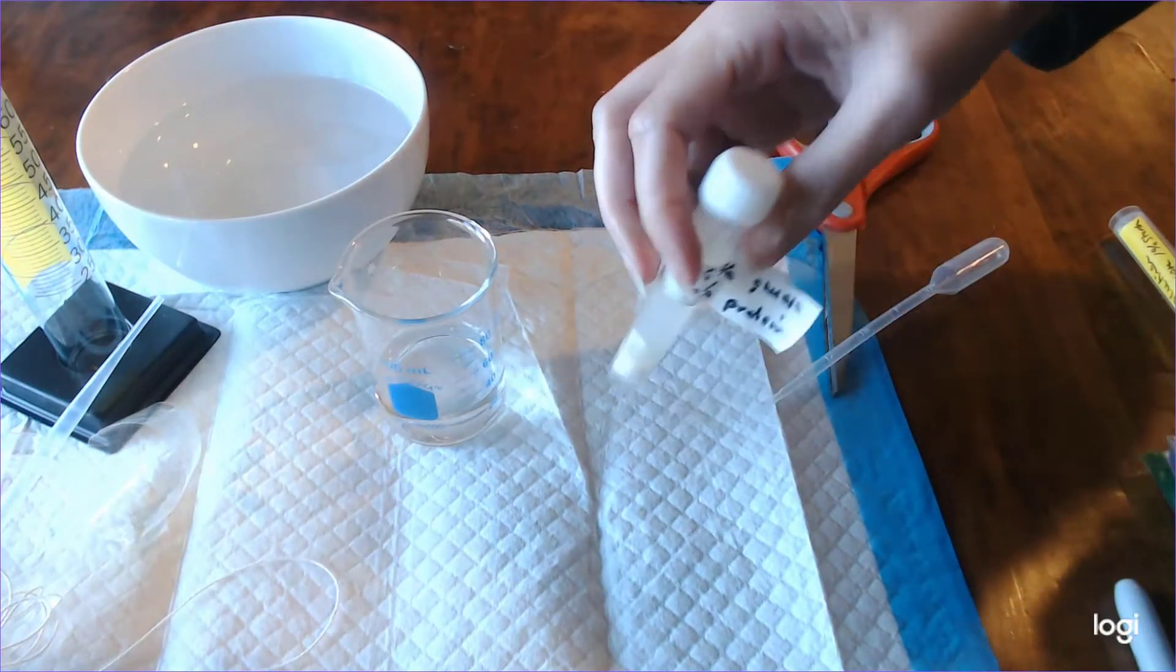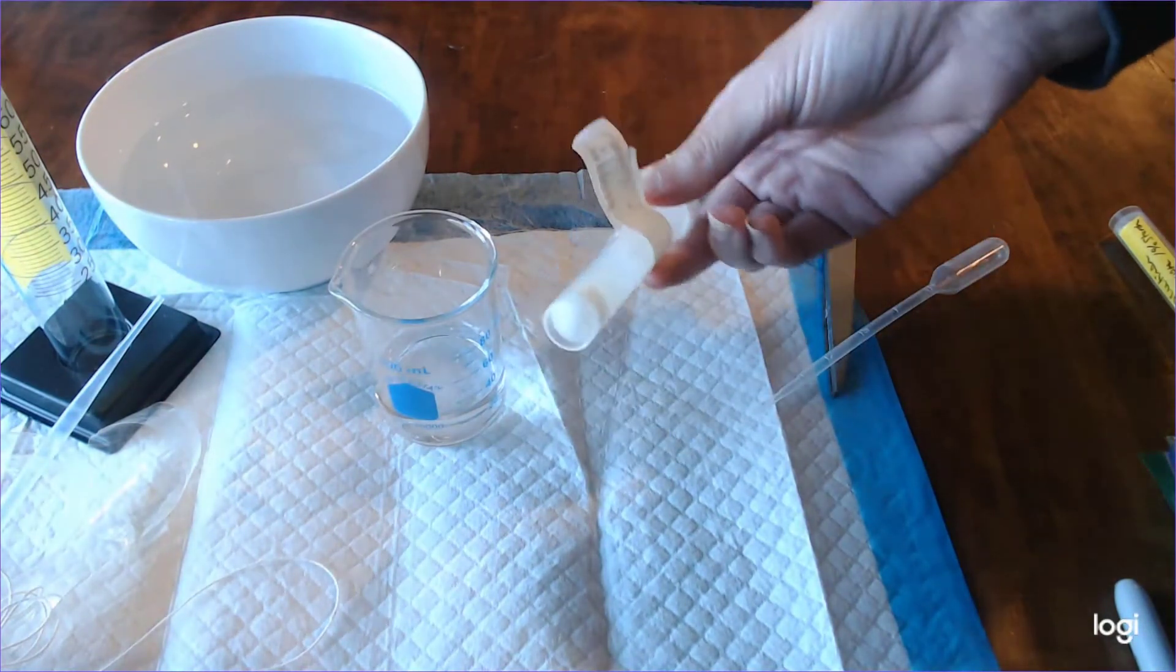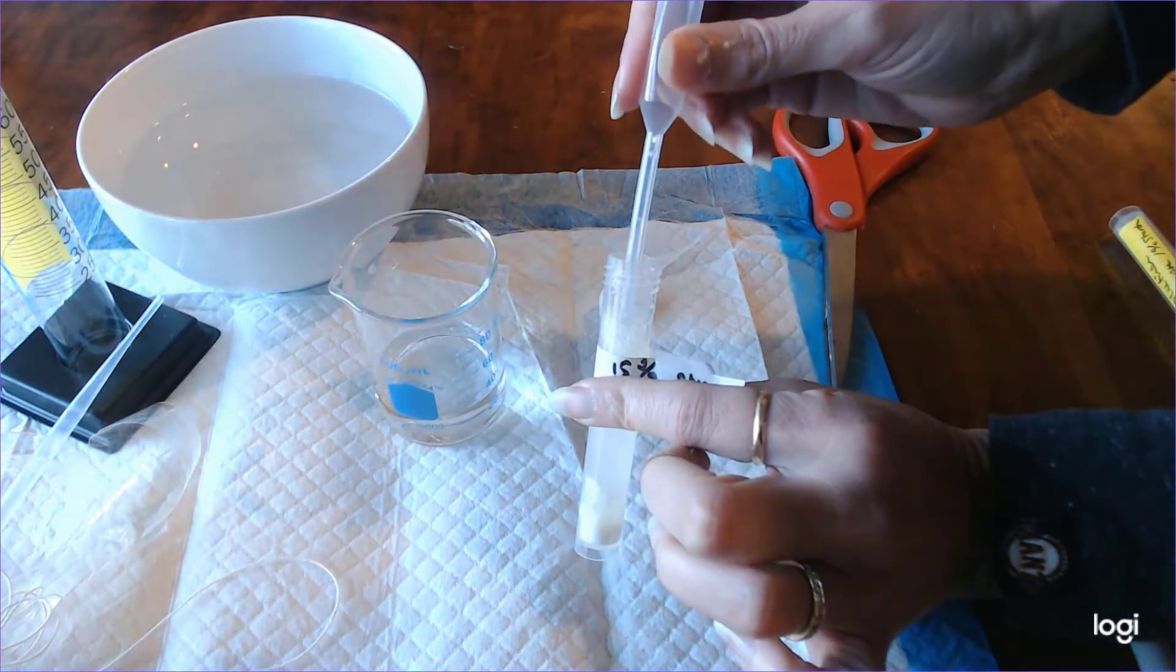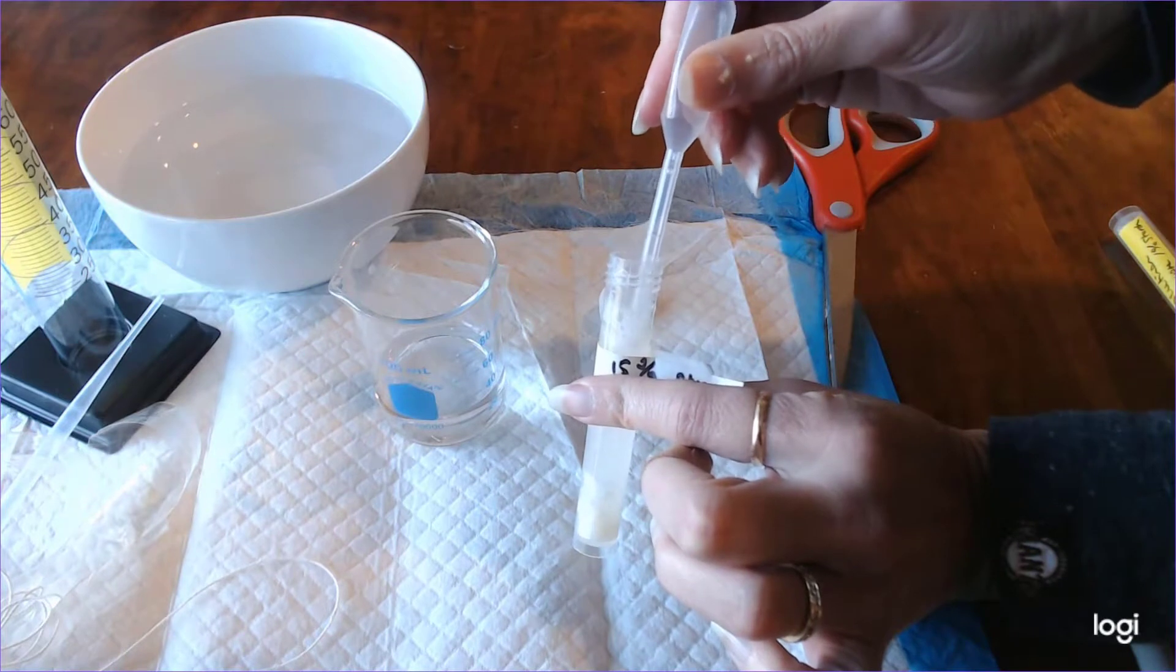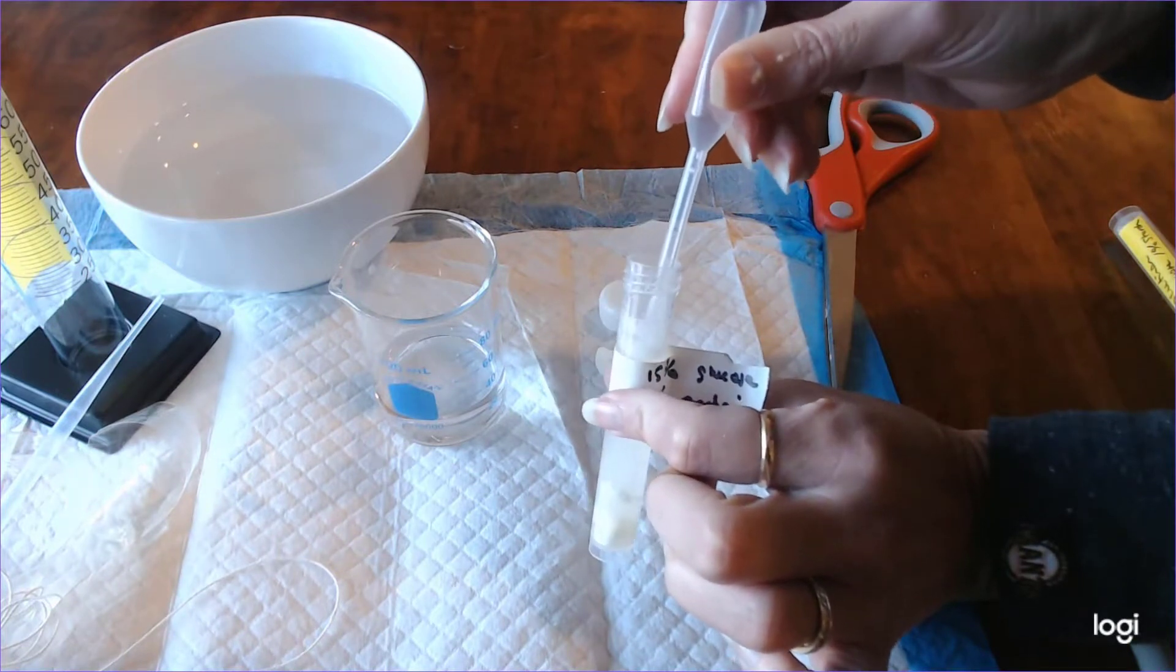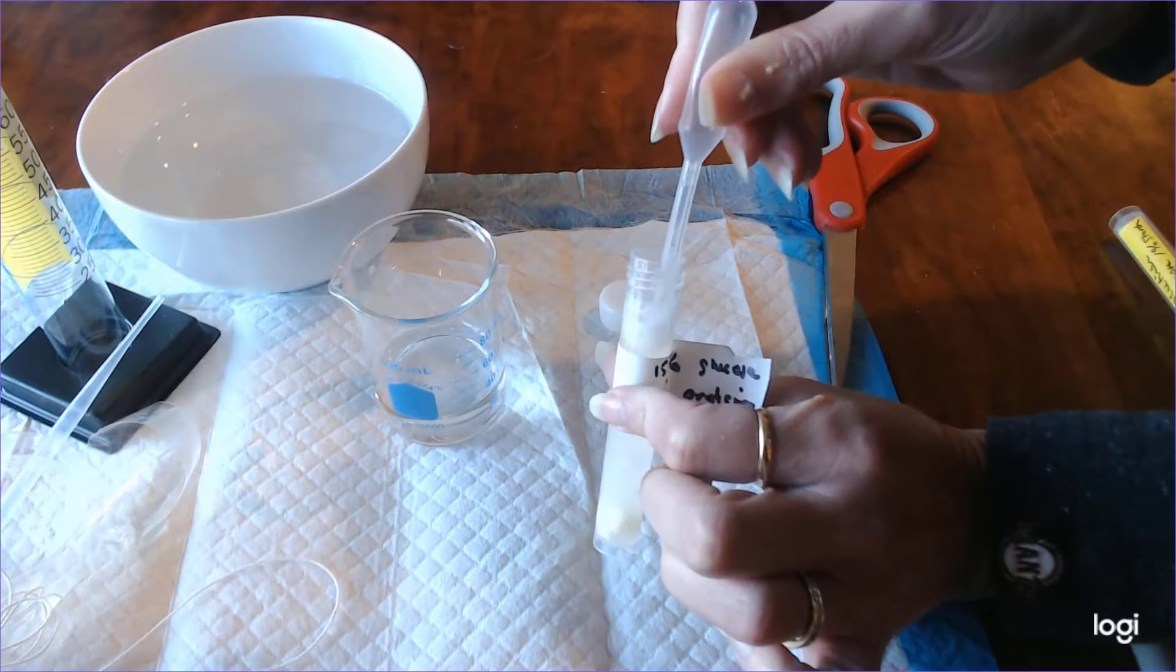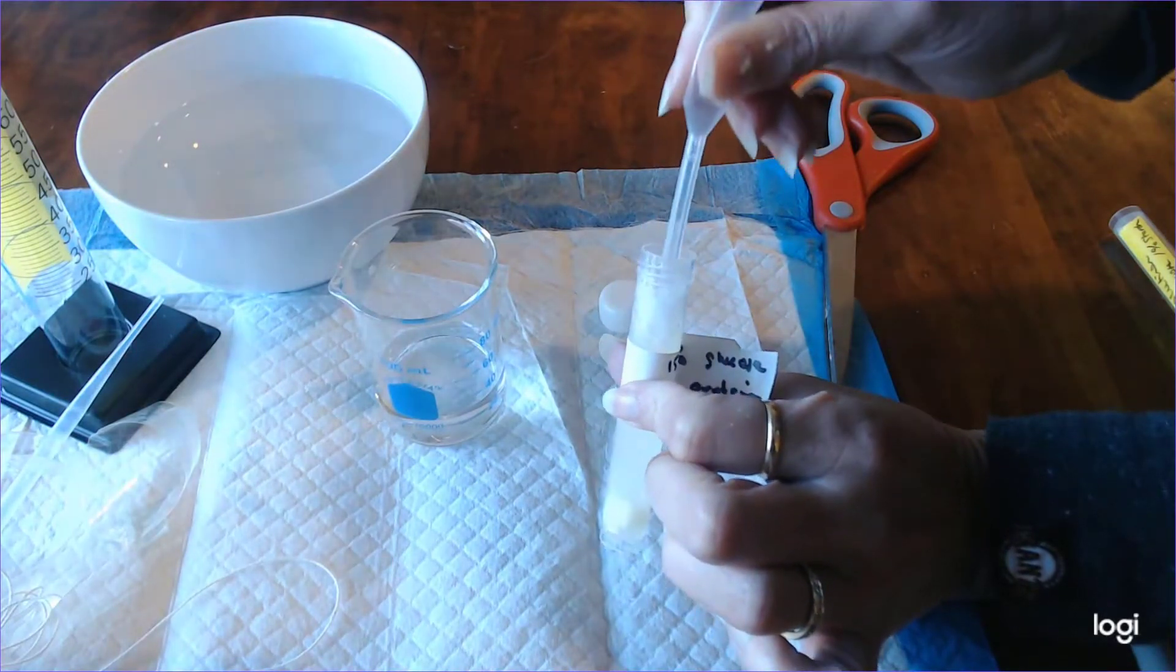So we're going to employ some tricks to help us out. The first thing that I'm going to do is use the plastic pipette that comes with the kit and kind of squeeze it to create some motion in there and hope that I can suck up some of the powder and get it to mix. That helps a little bit but it doesn't help enough.